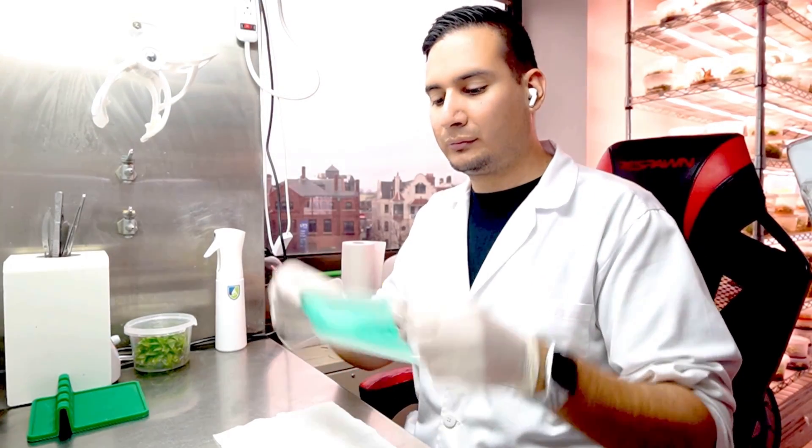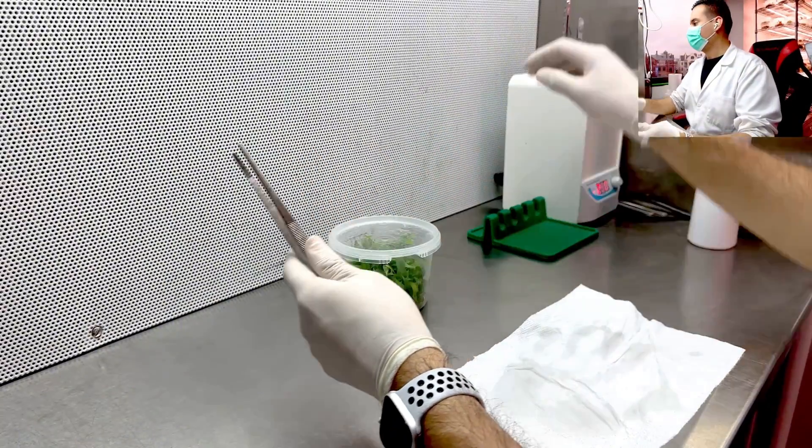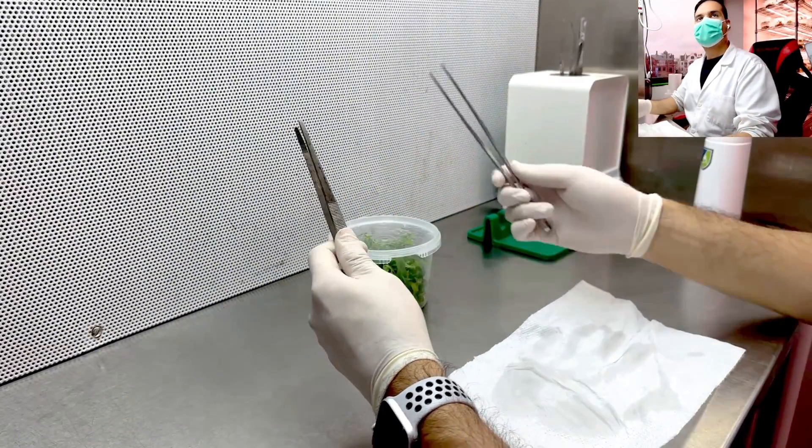Aseptic technique. When transferring your explants into the media, it is important to maintain aseptic conditions. Keep a good posture, wear a face mask, avoid touching sterile surfaces with your hands. Always use sterile tools and never place objects between your cultures and the clean air coming from the hood.